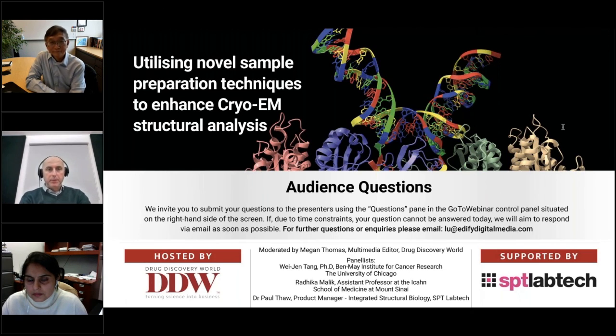Interesting. One late question that just flew through the door: what strategy can we try to minimize preferred orientation problems if we don't have access to a Chameleon? I should say there's an increasing number of Chameleons and access is growing almost by the week, so this should not be a problem for much longer. They ask about things like tilt collections, or whether you've used additives such as detergents to alleviate that problem.